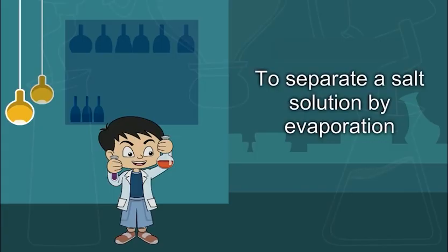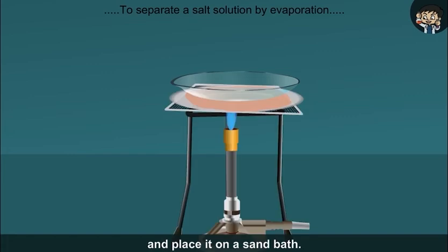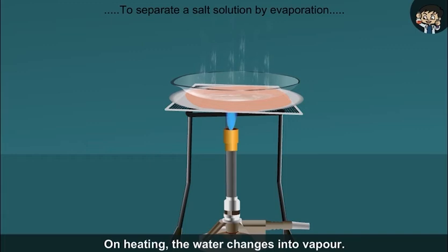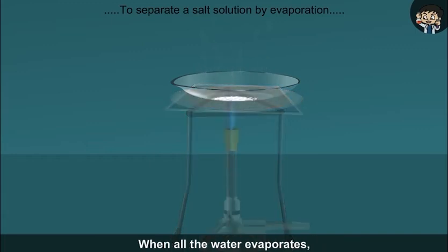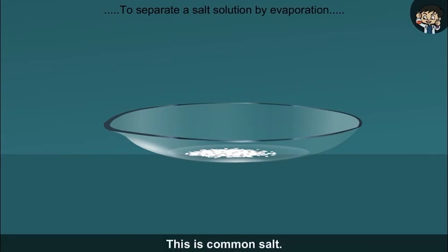To separate a salt solution by evaporation. Take some salt solution in a china dish and place it on a sand bath. On heating, the water changes into vapour. When all the water evaporates, you will see a white residue left in the china dish. This is common salt.